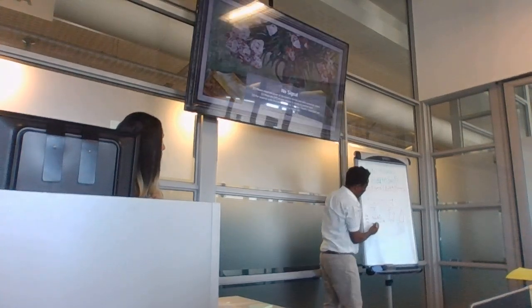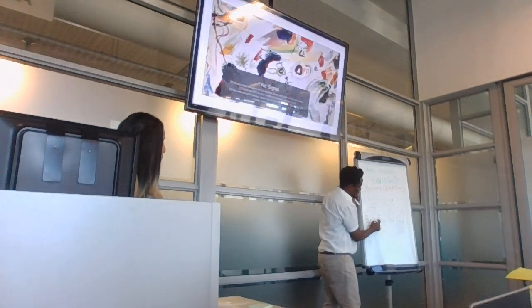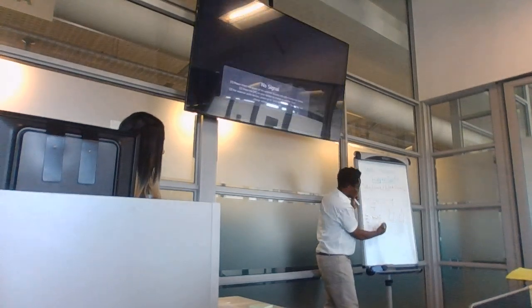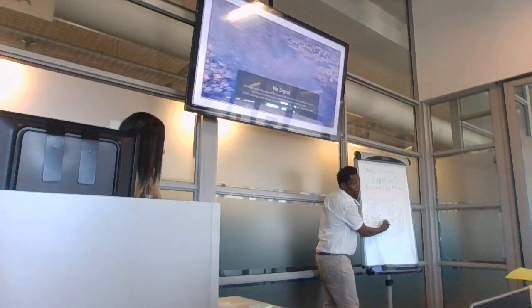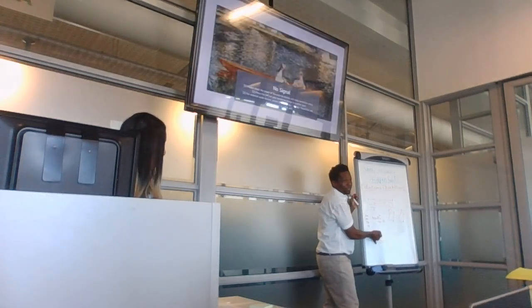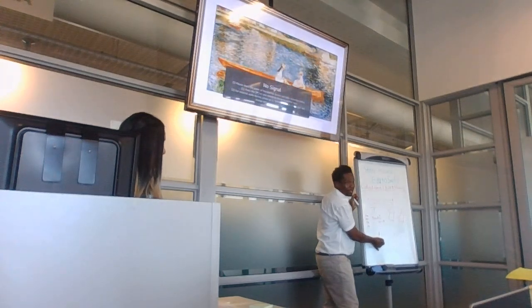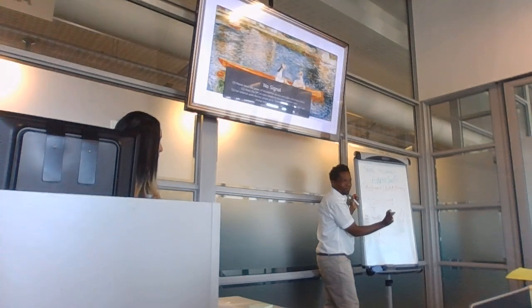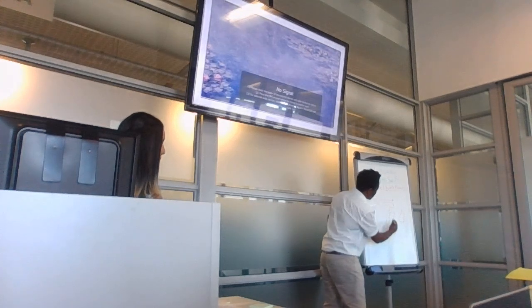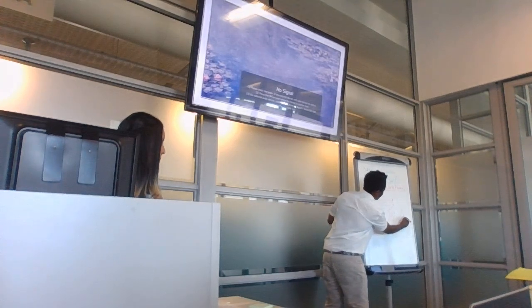Remember that when we do all this, we do some cleanup. We get rid of errors and things we don't need. We also remove primers and adapters, which I haven't mentioned. Within the forward read, we have a barcode and an adapter that adheres to the cluster, because we're doing sequencing by synthesis. So we have this embedded on a glass frame. Our file here has the forward reads.